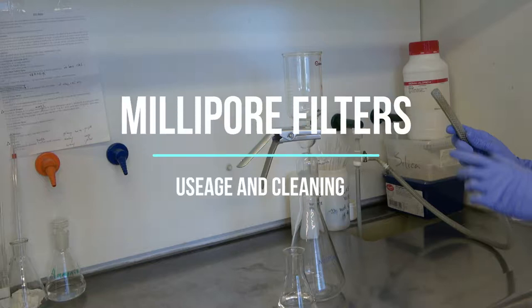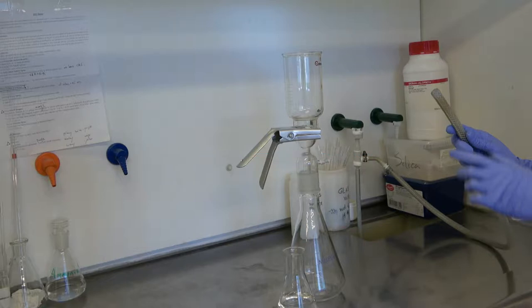Millipore filters are used to clean solutions, both to remove the muck as well as sterilizing the solution.